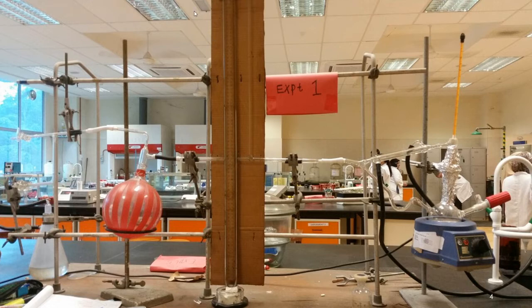This is what P atm is going to be, and the other part is connected to the system. This part is closed. Before anything is done, the level of the mercury for the atmosphere and the system is the same. That means the pressure of the atmosphere is the same as that of the system.